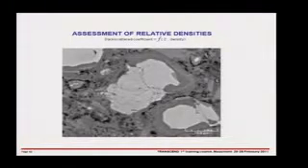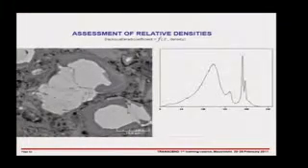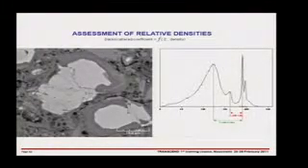So in order to get a quantitative analysis of what really is the grey level of a different phase, you have to calibrate it to things you know about. And in this example here, we use the calibration relative to 2 things which have a pretty fixed density. One was the alite phase here, and the other was the calcium hydroxide here.